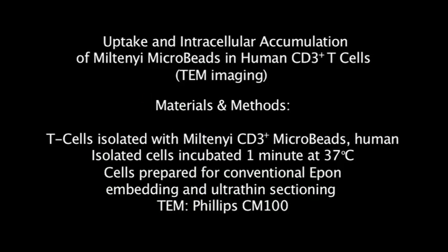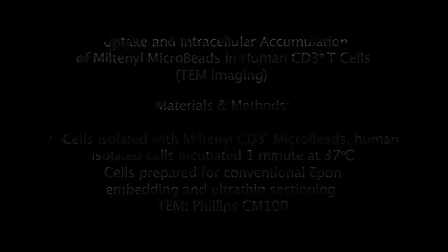For better resolution, and to ensure the visualization of the Miltenyi microbeads was not due to artifacts, transmission electron microscopy, TEM, imaging is used. T cells are isolated with Miltenyi human CD3 microbeads following the manufacturer's protocol, prepared using conventional EPON embedding and ultrathin sectioning, then visualized using a Philips CM100.